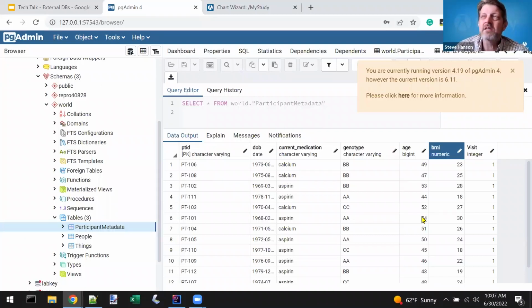I don't really have docs on how I set up my demo, but all the elements are in the docs. Basically I just created a study and created an ETL. So all the elements are there, but I must say I don't have the whole narrative as a single item.